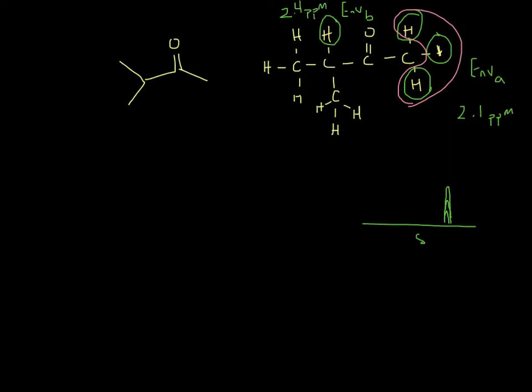But the point remains, it's slightly different than environment A. However, this one only has one hydrogen, so it's just going to have one peak. There's going to be nothing stacking on top of it because it's all by itself. All right, moving on to this bottom carbon.